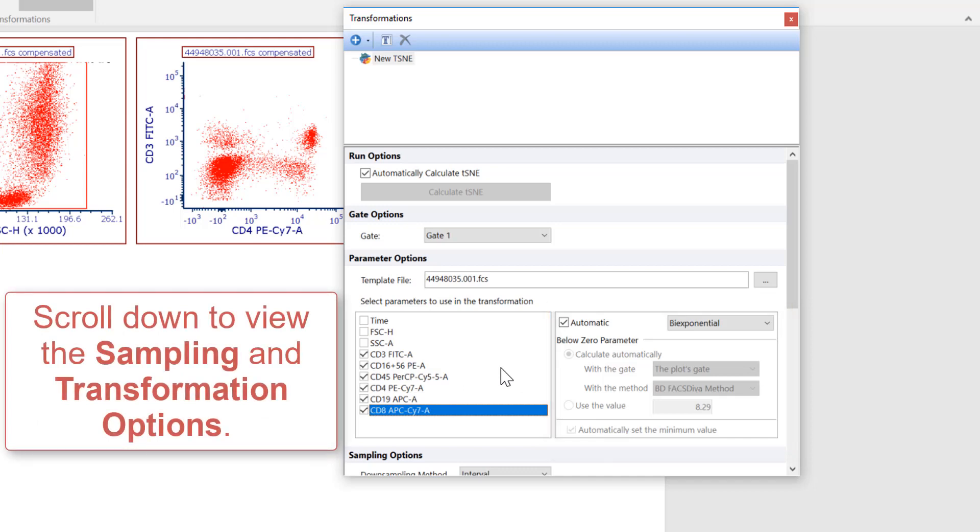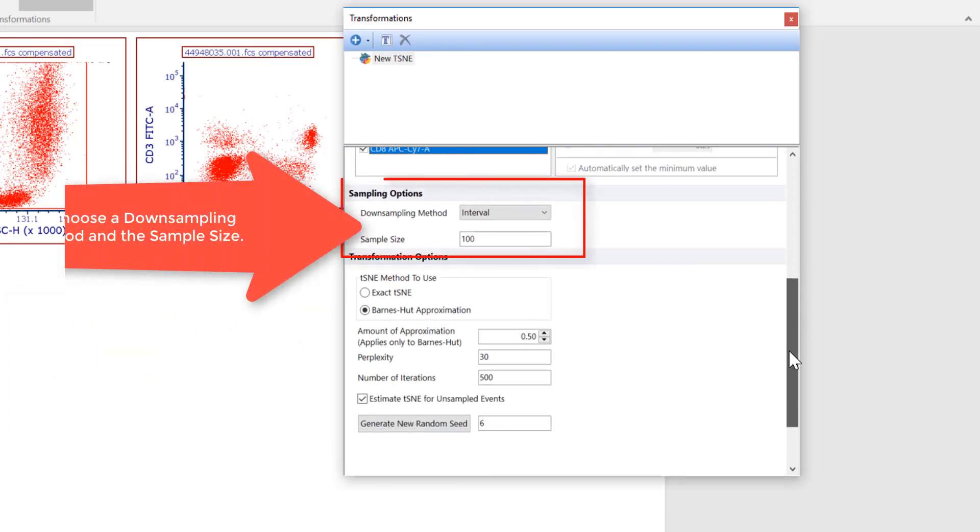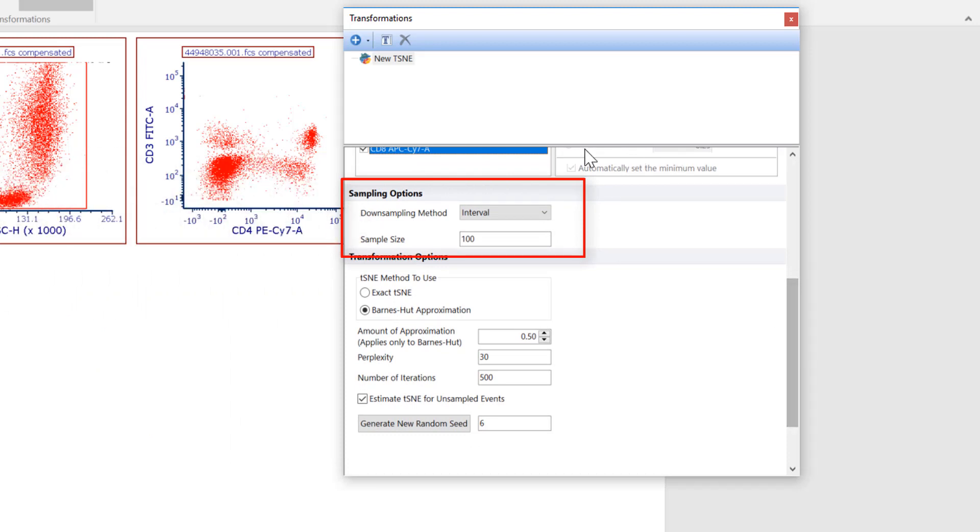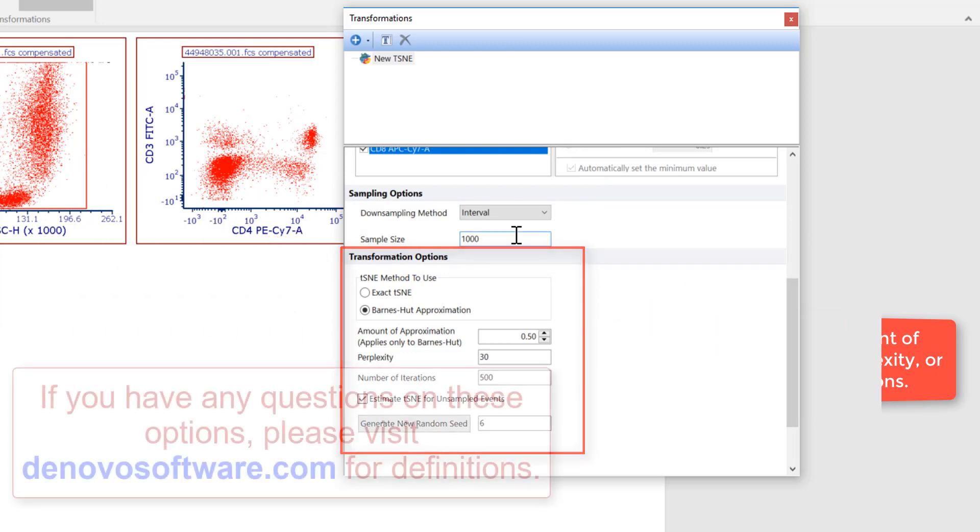If you scroll down, you can see the sampling and transformation options. You may change your down sampling method and sample size under the sample options. Transformation specific options such as the amount of approximation are located under the transformation options.